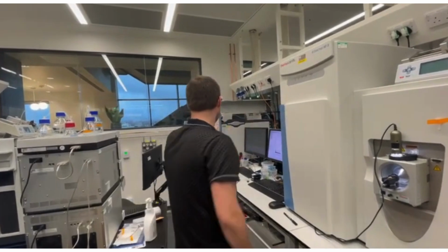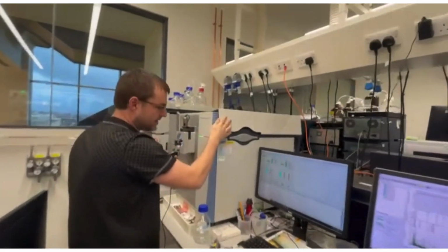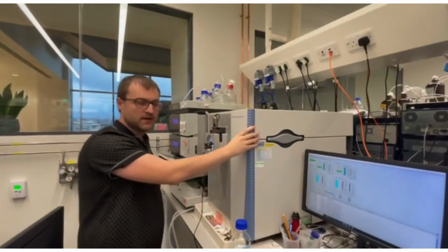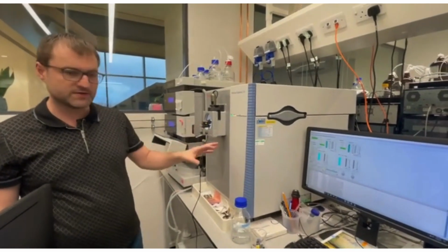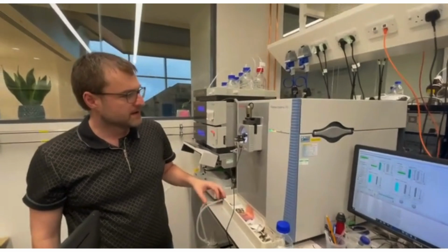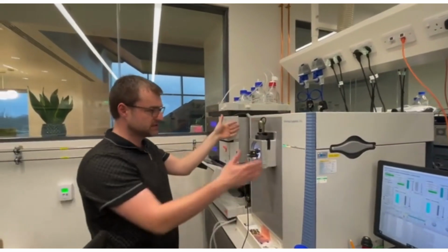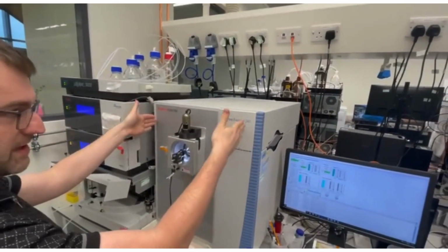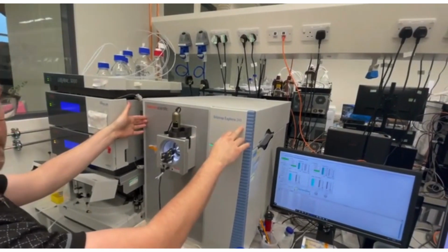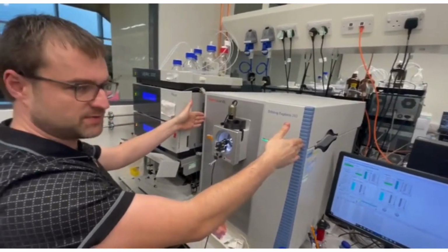This device, Orbitrap Exploris 240, is a newer system. Right now it's off. There is a little bit of a problem with it, and we are waiting for an engineer to come have a look at it. We really like this device. If you look here, the components inside the Orbitrap Exploris are the same as on the HFX, but this device is about three times smaller.